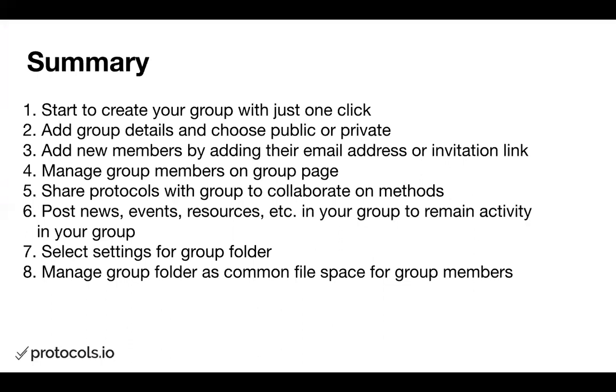You can manage the group members on the group page, so you can give different members different abilities to manage within the group. So for example, if you want somebody to be a co-admin, you can select that, or different things like jobs, news, discussions, handling. Also, if you share your protocols with a group to collaborate on methods, you can do that by dropping the protocols into the group folder, and that will give everybody access to the protocol, and people can collaborate on them by using the commenting functionality and versioning.